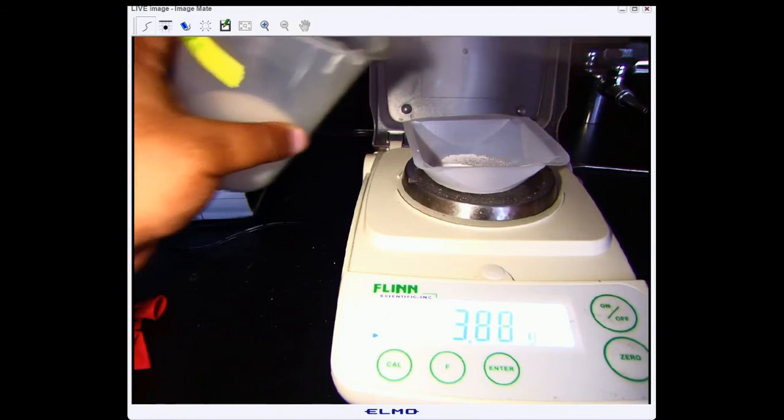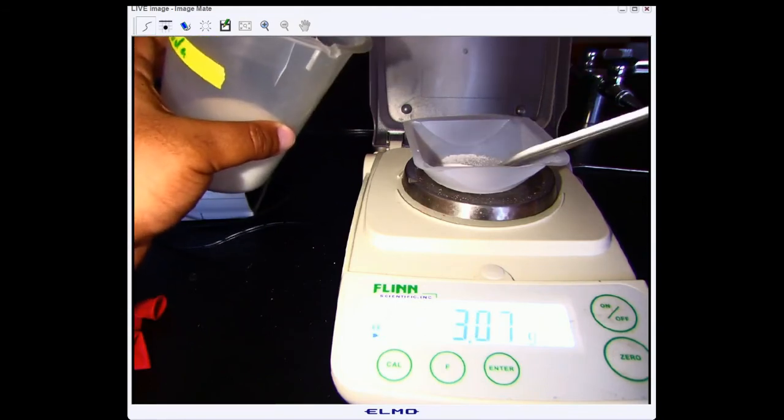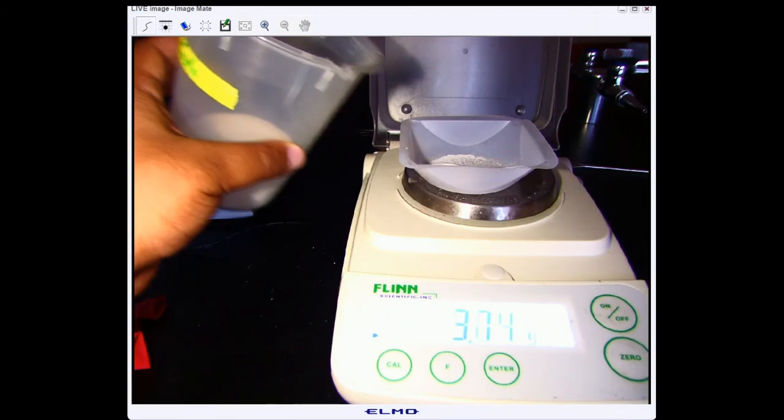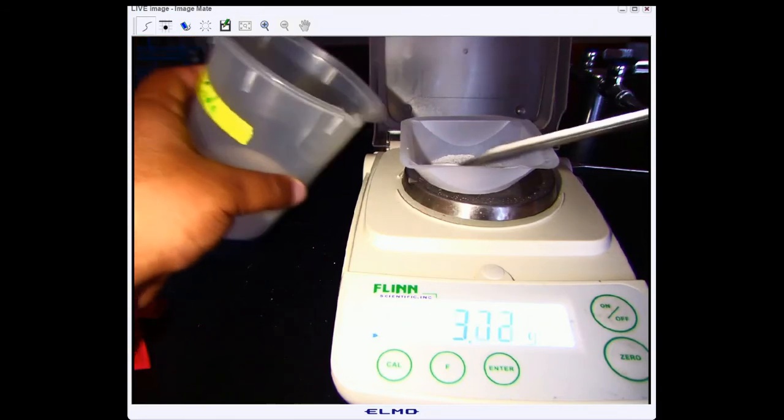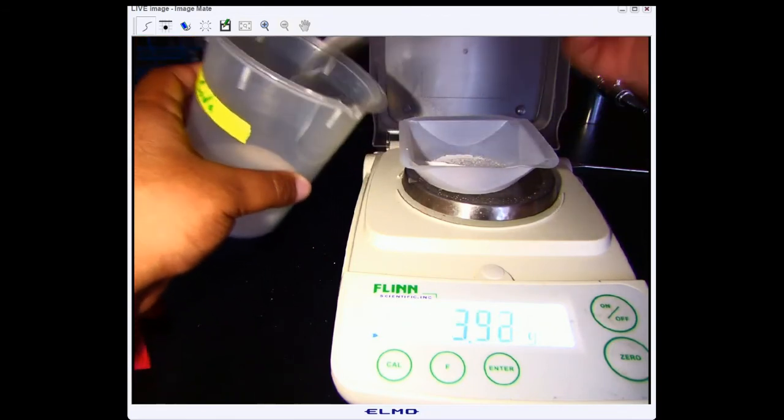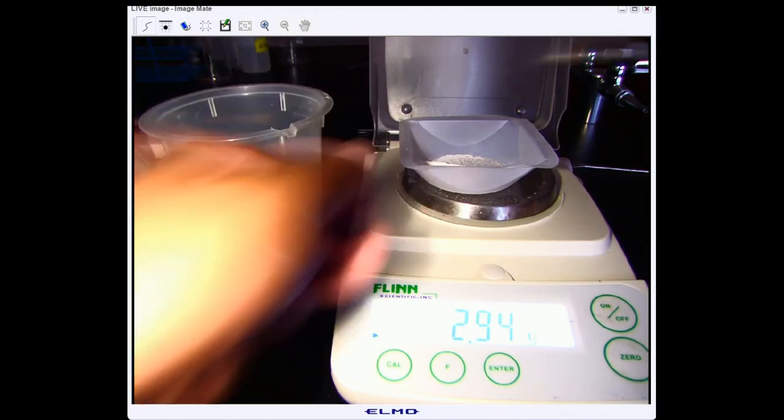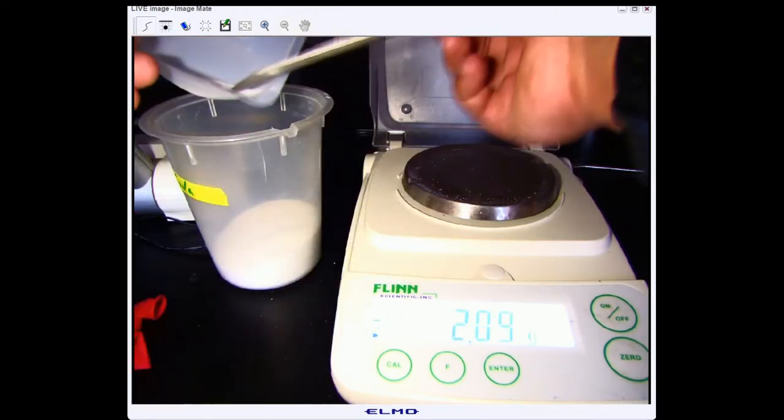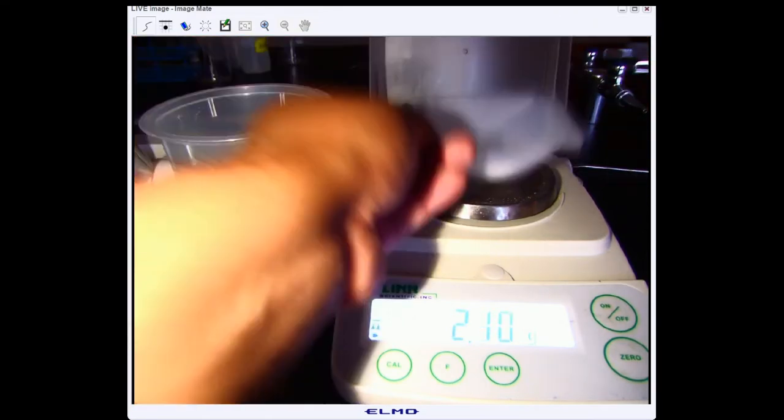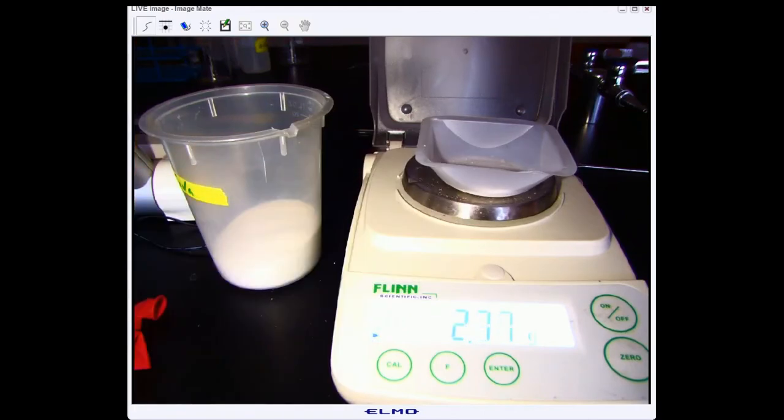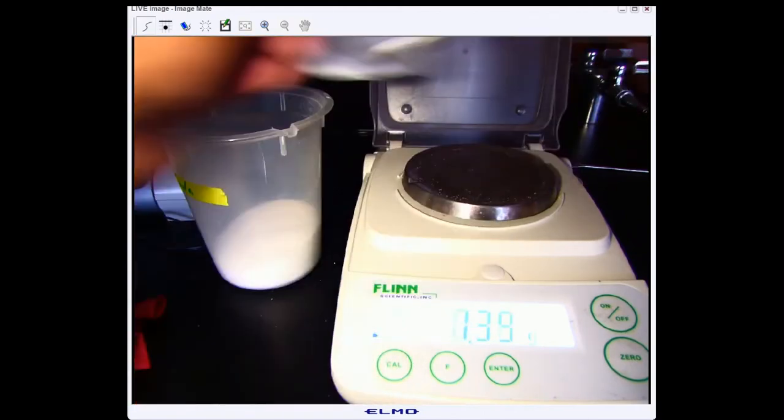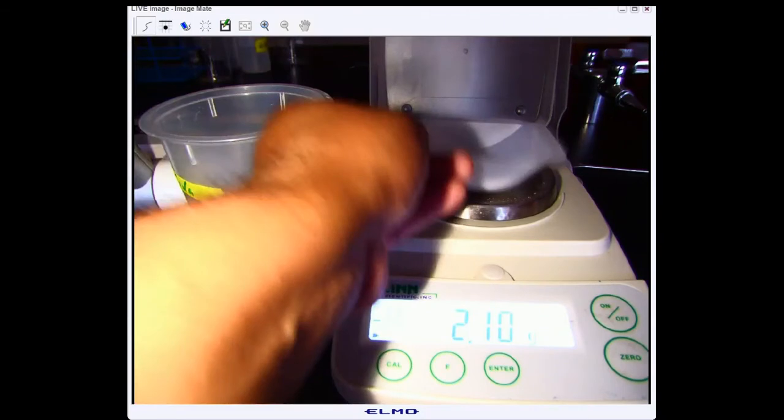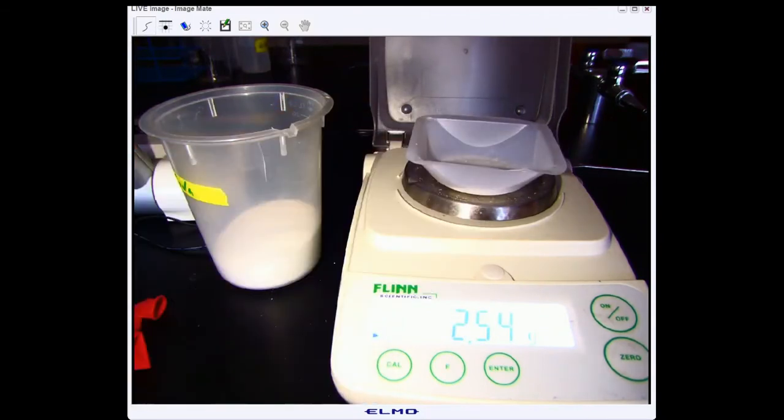Okay, so we don't want to go over two and a half grams. There we go. That's close enough. Two point five four.